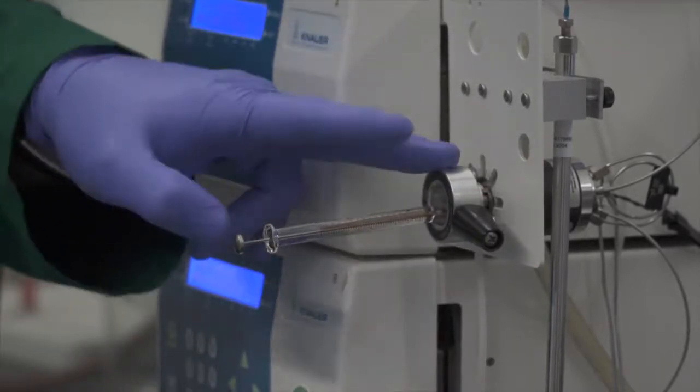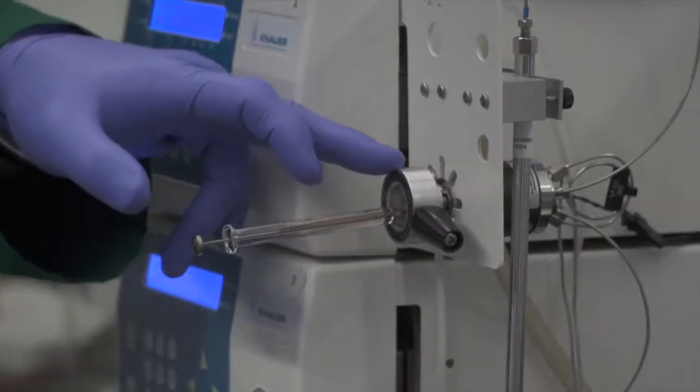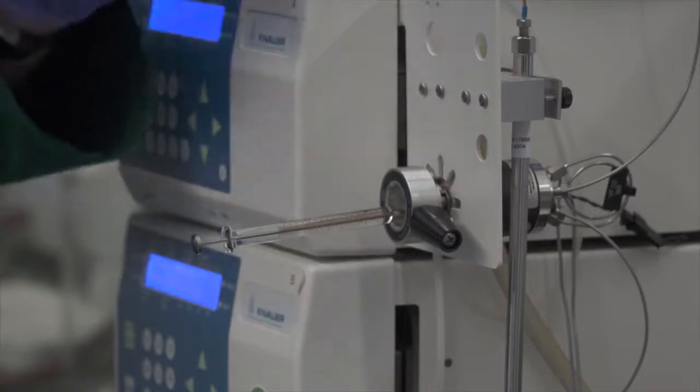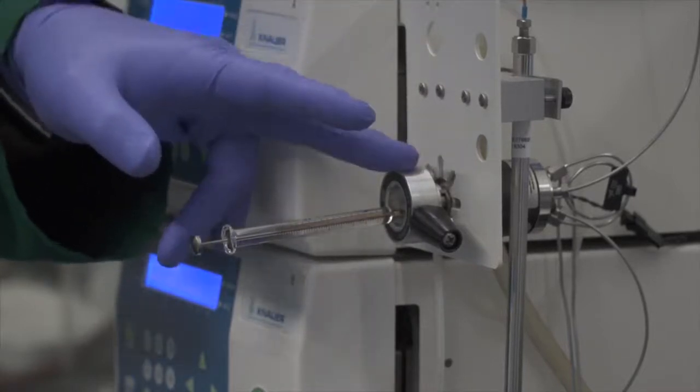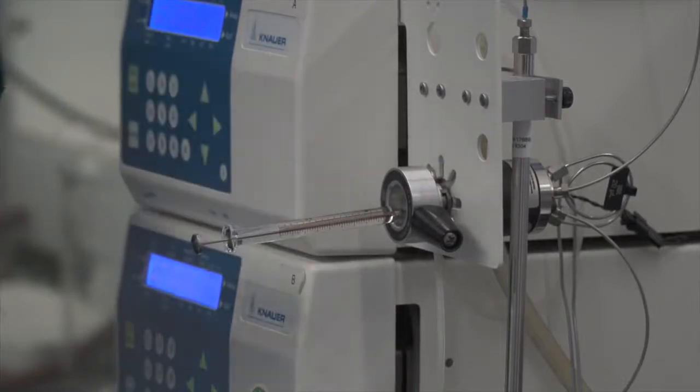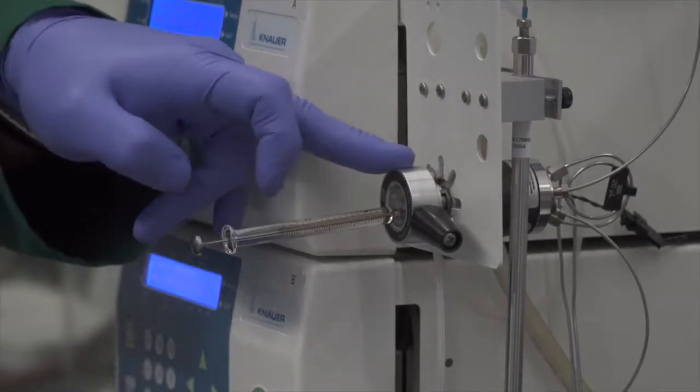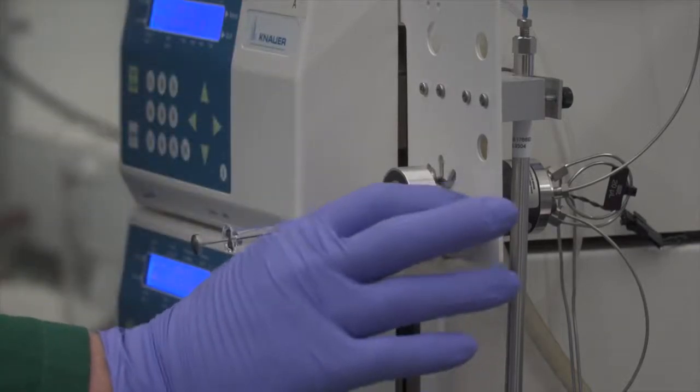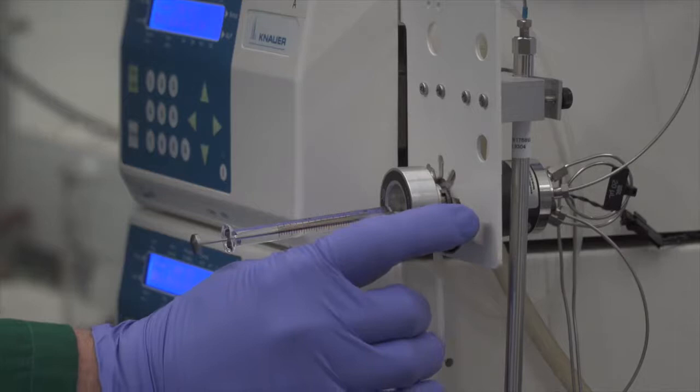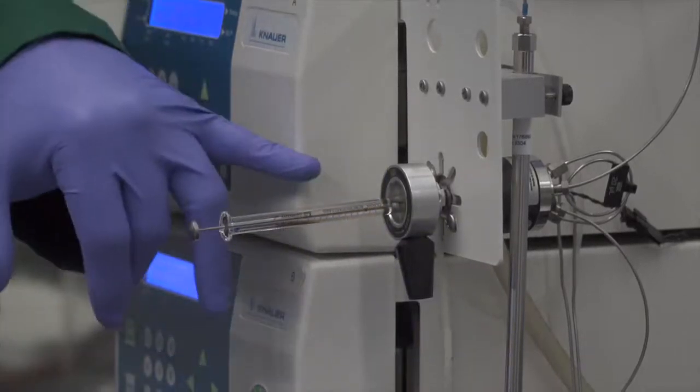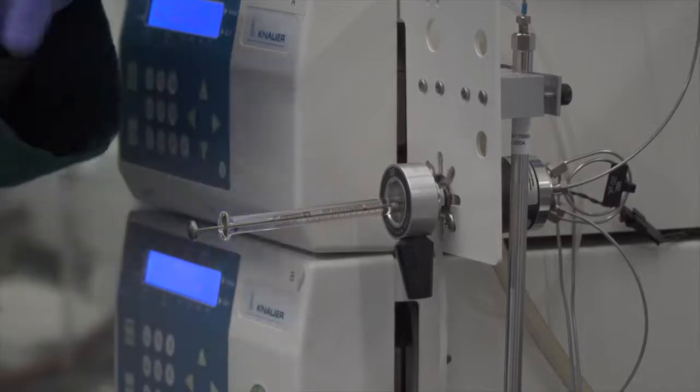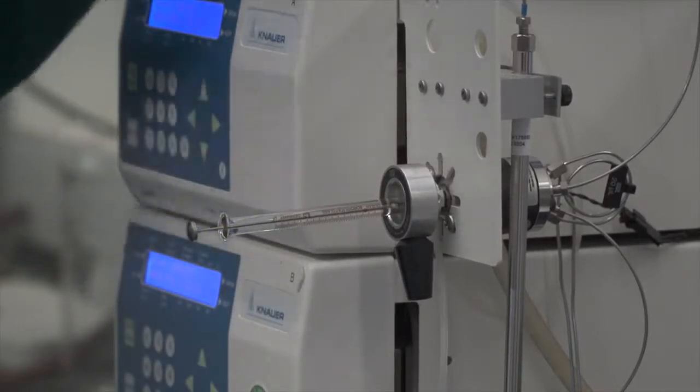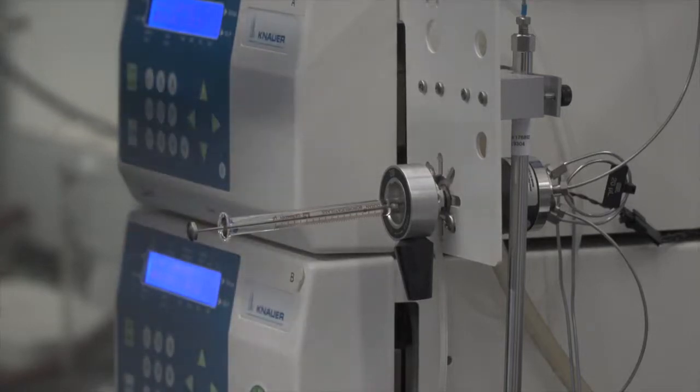Now what we're going to do is we're going to change the injection port from the load position to the inject position. And remember that load and inject on an injection port refers to the sample loop, not the syringe. So we've loaded the sample loop. Now we want to inject the contents of the sample loop onto the column, and we literally just have to turn it down like that. There is a switch inside the injection port that registers when it's been turned, and will trigger the computer to start recording data.